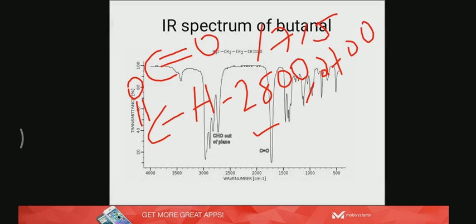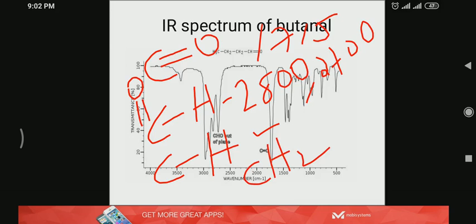Two peaks are given by aldehyde. This is very characteristic of aldehydes, and this is how we distinguish aldehyde from ketone, because ketone also will give a carbonyl peak at around 1715, but this CH of aldehyde is given only by aldehyde. In addition, it will have, as usual, the CH stretching frequency of aliphatic sp3 carbon, and there will be CH bending frequency as well.